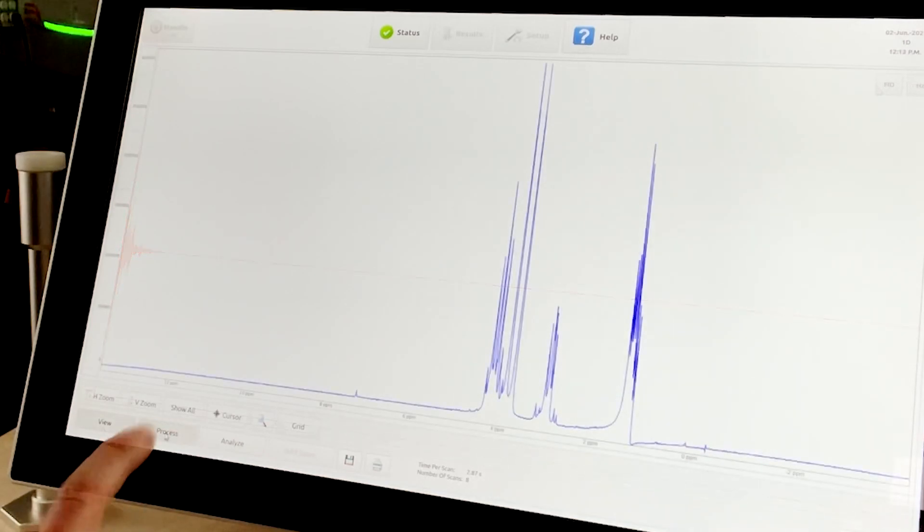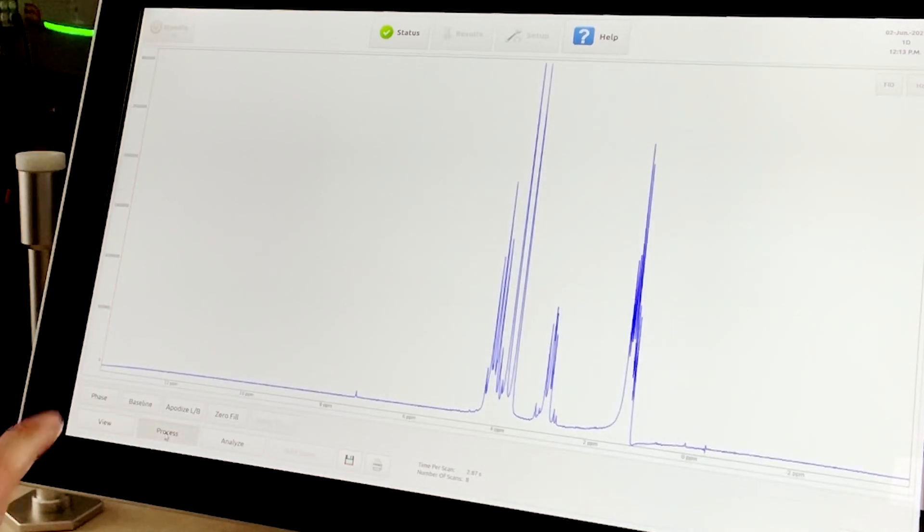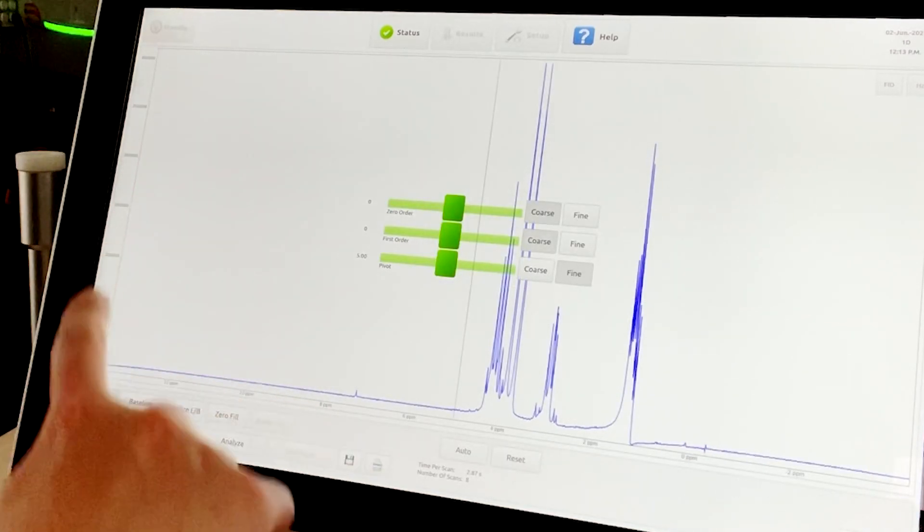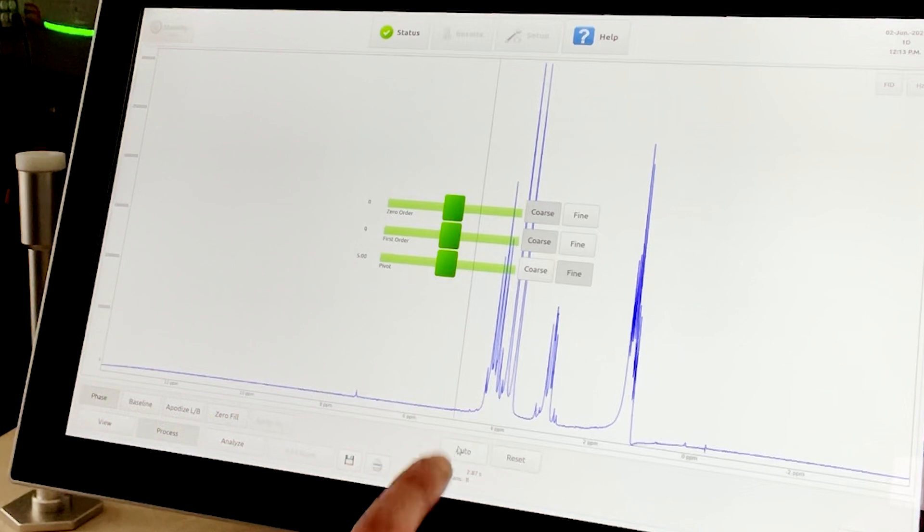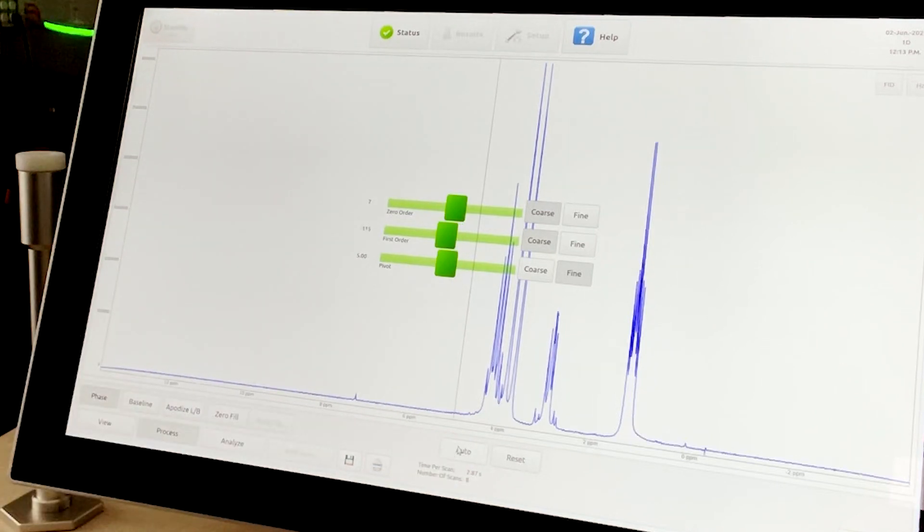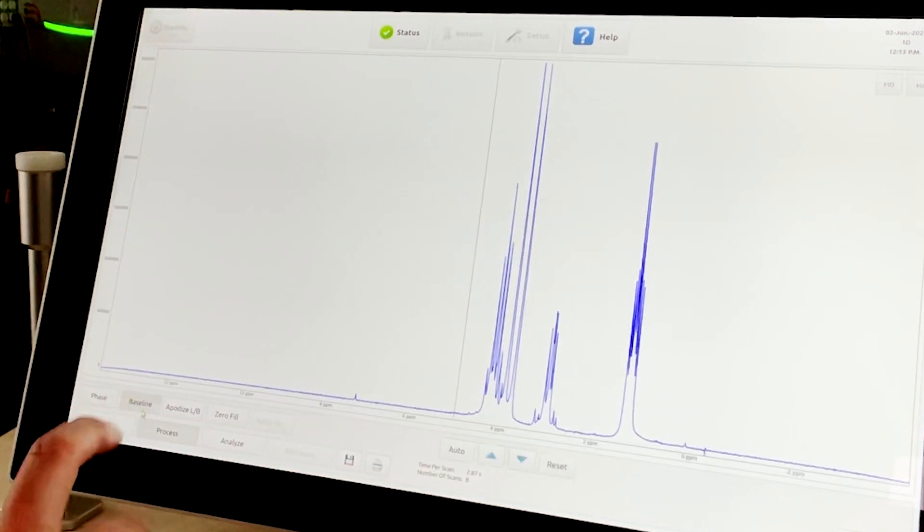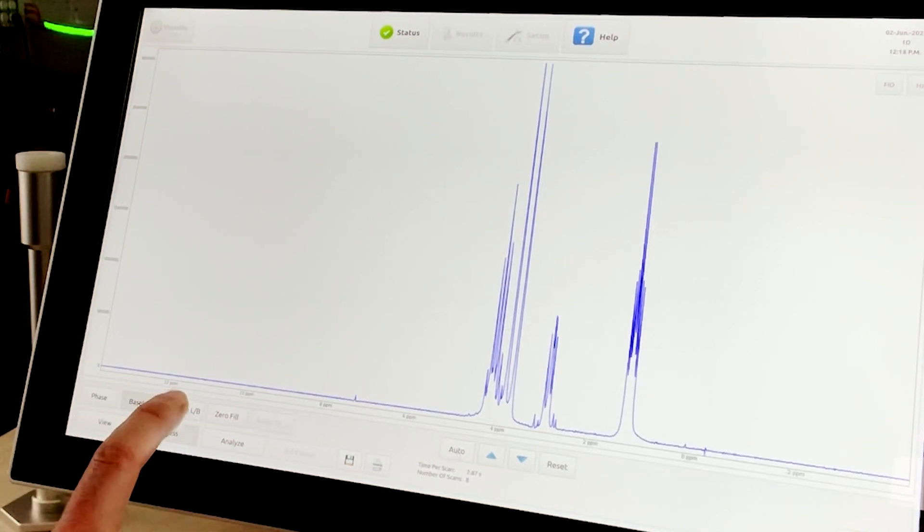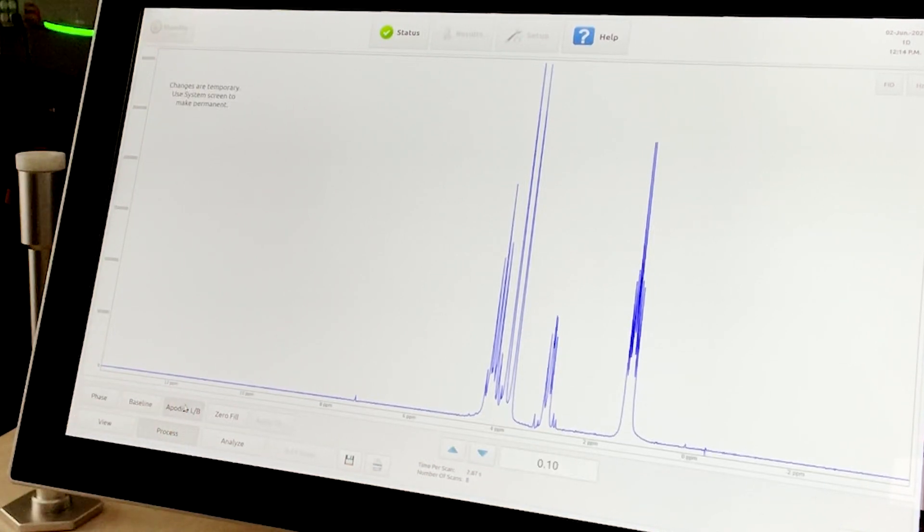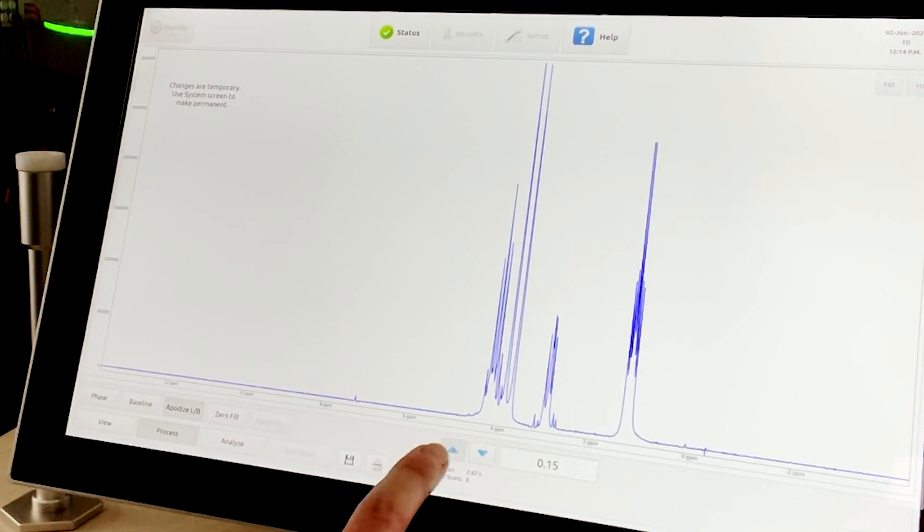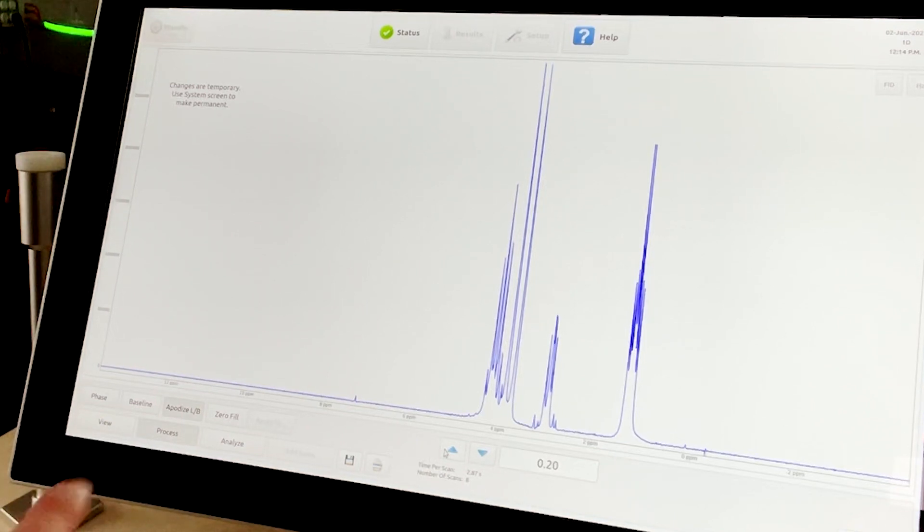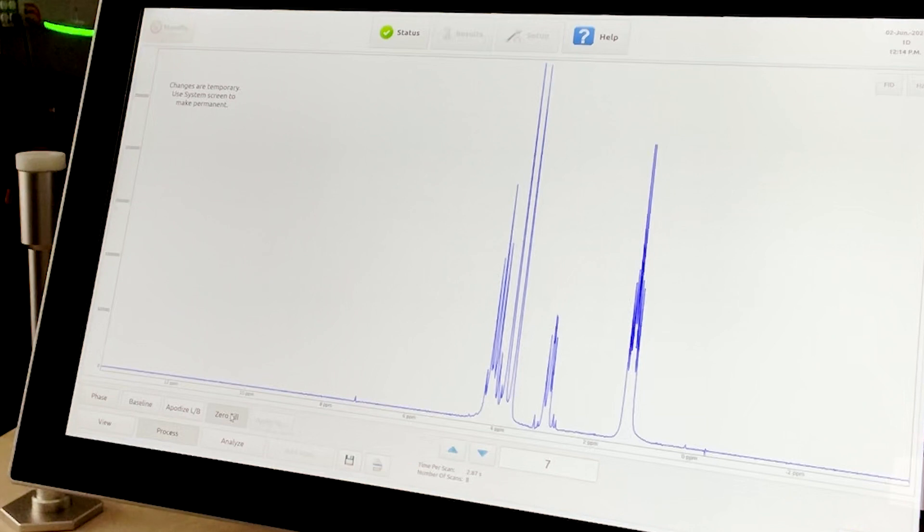For basic processing, there are automatic or manual phase options. The data can be baseline corrected. And again, post-processing apodization and zero filling can be modified easily here. Apodization is useful to improve resolution at the expense of the noise in the baseline, or it can smooth the baseline, but it also broadens out the peaks.